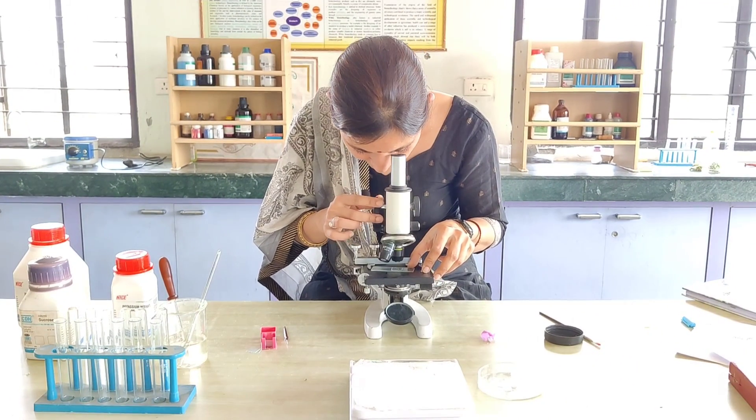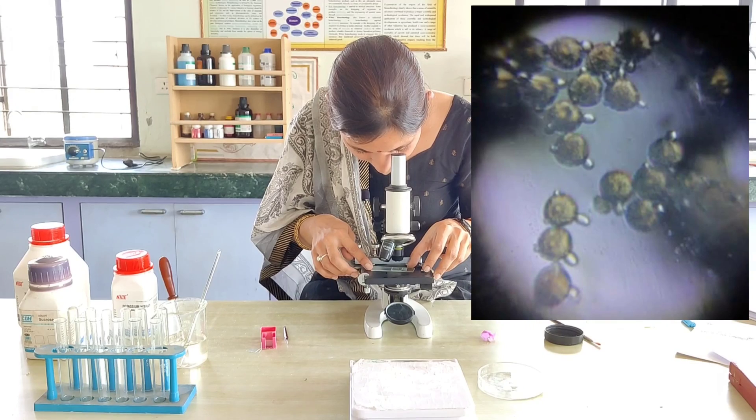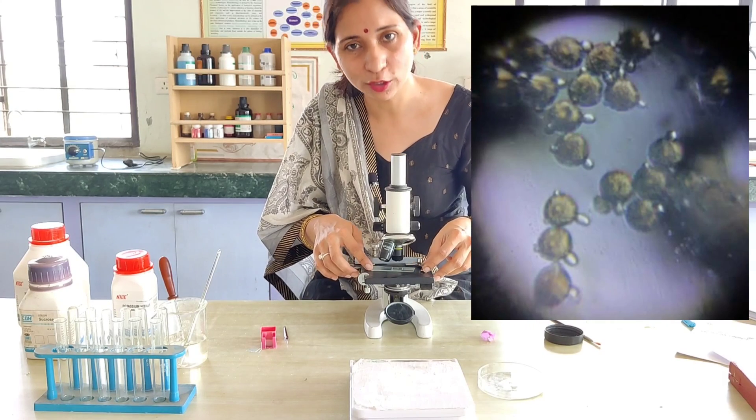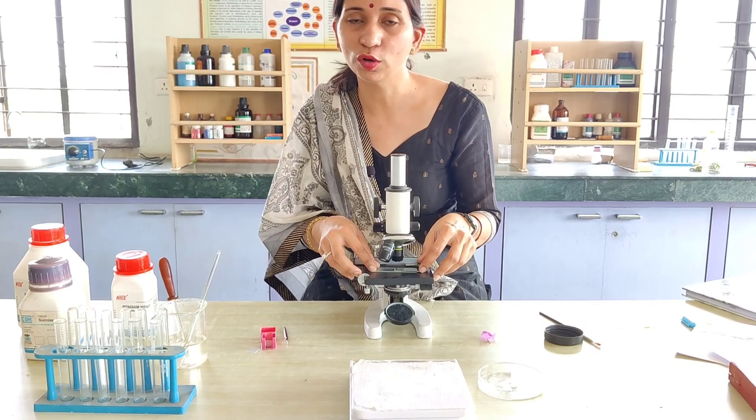Yes, pollen grains are visible. If you observe this slide after some time, like after 30 minutes, you will be able to see the pollen tubes as well — the pollen tubes start emerging from the pollen grains. We will observe this slide after 30 minutes to see the pollen tubes. That is about this experiment — pollen germination on the slide.